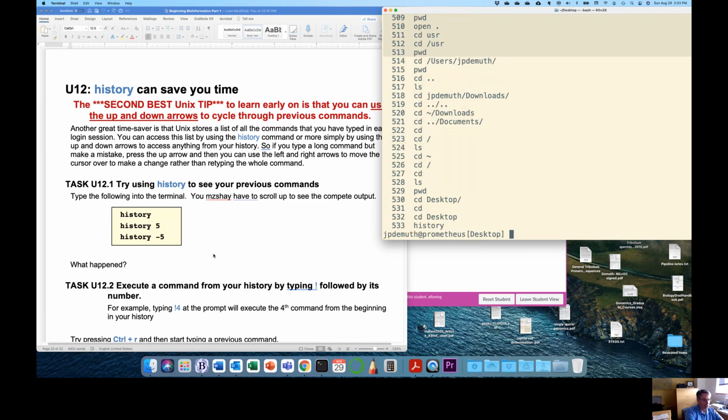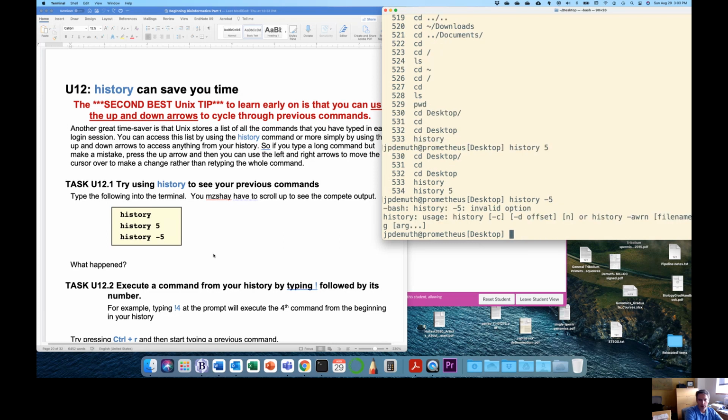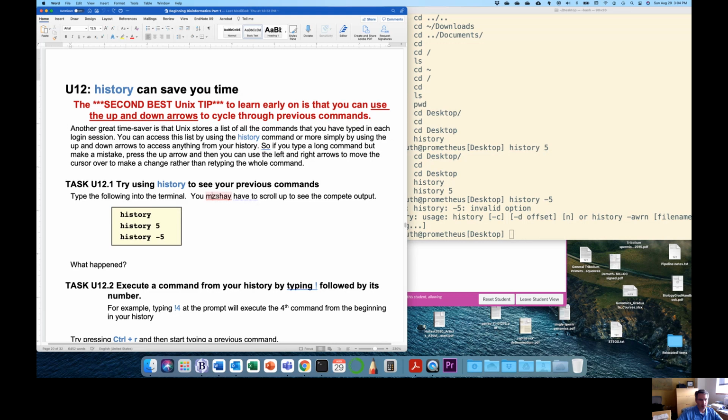You can play around with these, right? If you want to see just, say, the last 5, you can do that, if you know it was recent. That's interesting. I don't know what happened here.